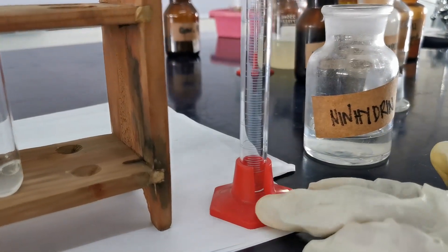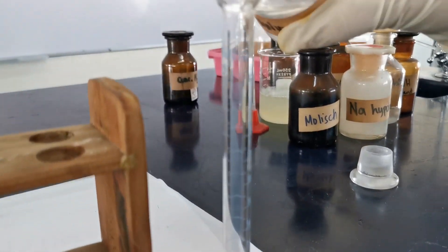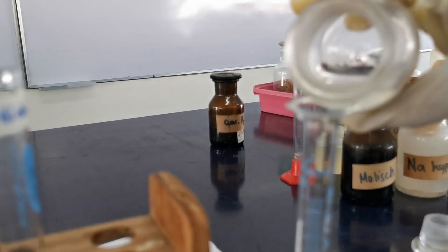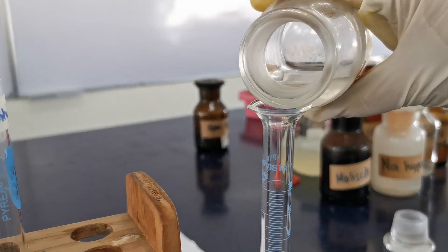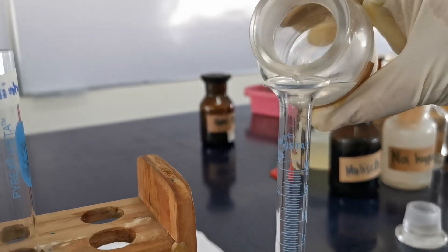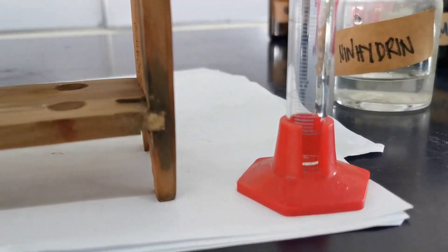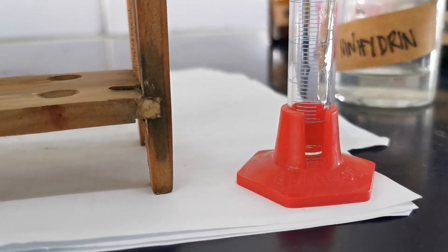Using the graduated cylinder, get 1 ml of egg albumin solution and place it in a clean test tube. Afterwards, add 1 ml of freshly prepared 0.1% aqueous solution of ninhydrin.